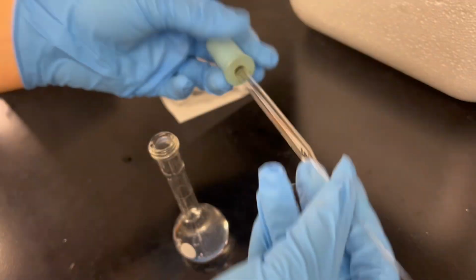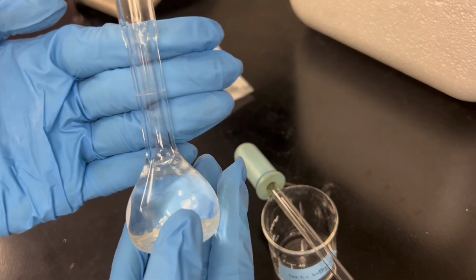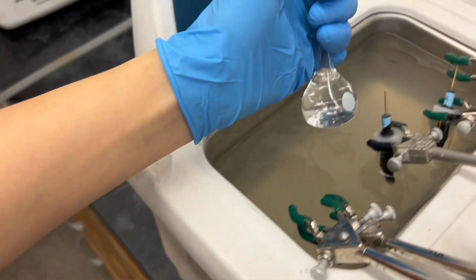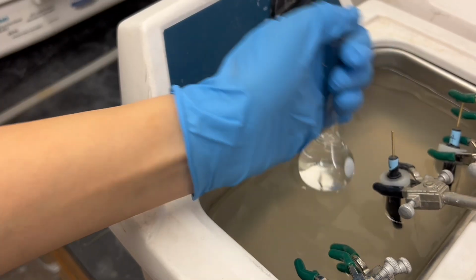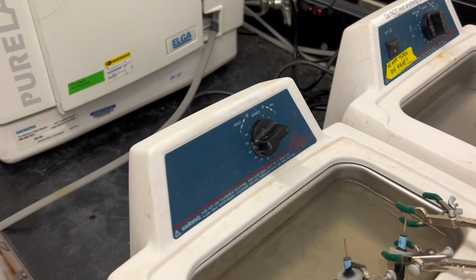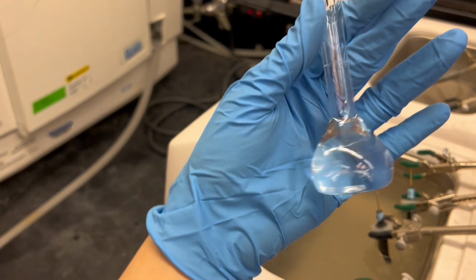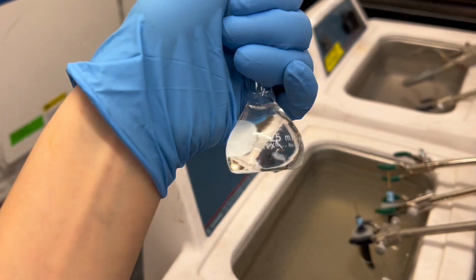But for adding PFAS, we still need some solvent to rinse it from the weighing paper. So we want to leave some volume space for rinsing the PFAS later. And then we parafilm the top of the flask and mildly and quickly sonicate the solution. Make sure it is not obviously bubbling. And we could also tell that there's no solid in it, it's fully dissolved. Then it's good for the degas step.